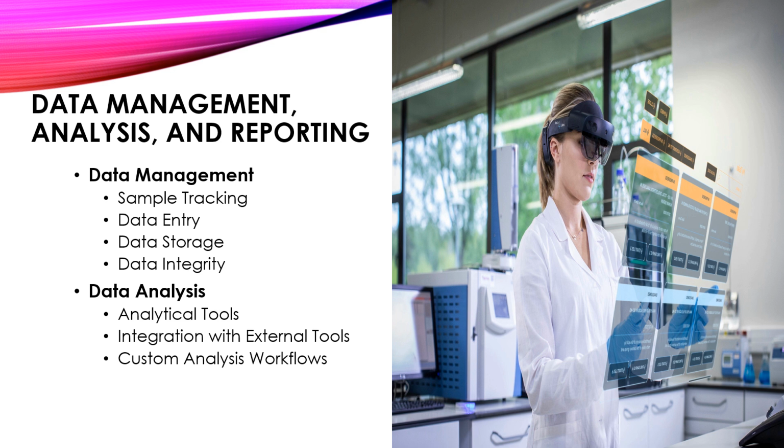Next is data analysis. This involves using tools such as analytical tools, external tools, that is integration with external tools, custom analysis workflows, and the likes. Now, analytical tools. Laboratory management systems may provide built-in analytical tools for performing statistical analysis, trend analysis, and quality control checks on the collected data.